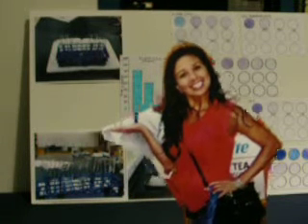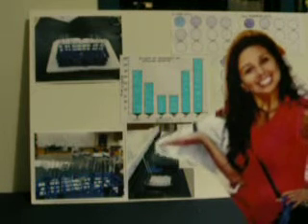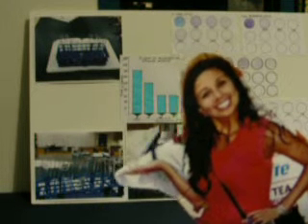Our experiment is the impact of temperature on amylase activity. Our group's prediction is that as temperature increases, this will speed up the activity. The independent variable, which is the one that will be manipulated, is temperature. The dependent variable, which is the one that will be measured or observed in response to the conditions, is amylase activity.